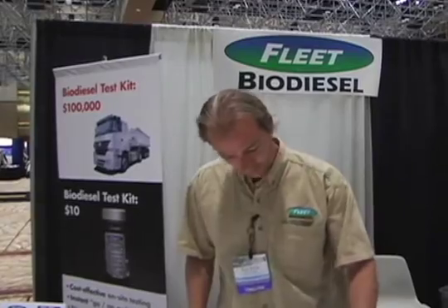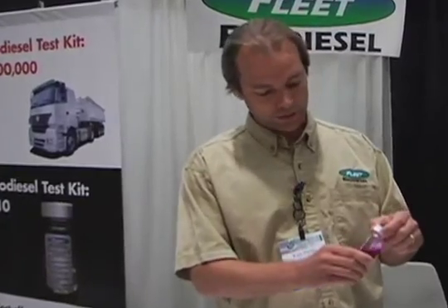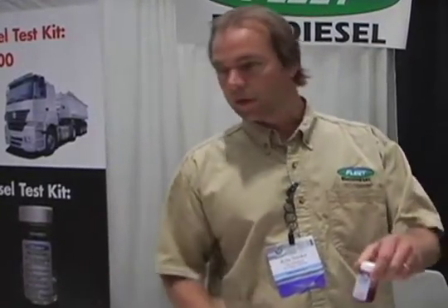I'll give you a demonstration on how this kit works. They're made to be very easy one-step tests that change color if and when there's a quality problem. This one just arrives like this — somebody from the fleet yard can go out and take a sample of their fuel right out of the tank, either out of the vehicle tank but most commonly just straight from the nozzle, out of their storage tank.